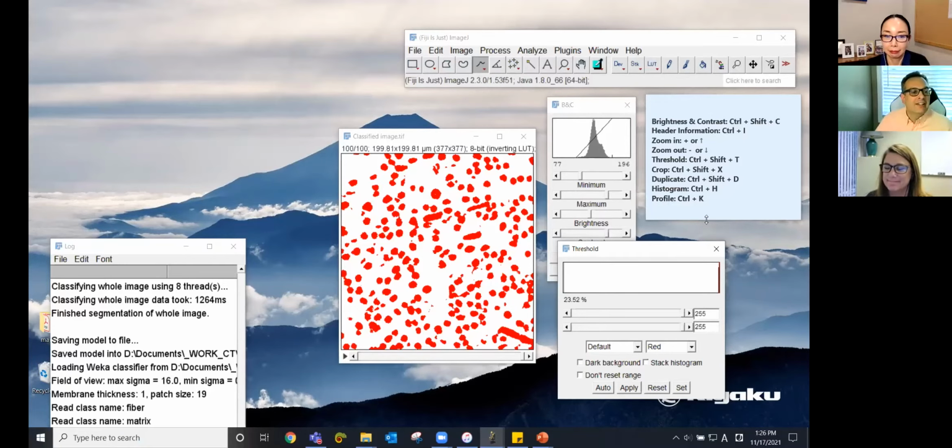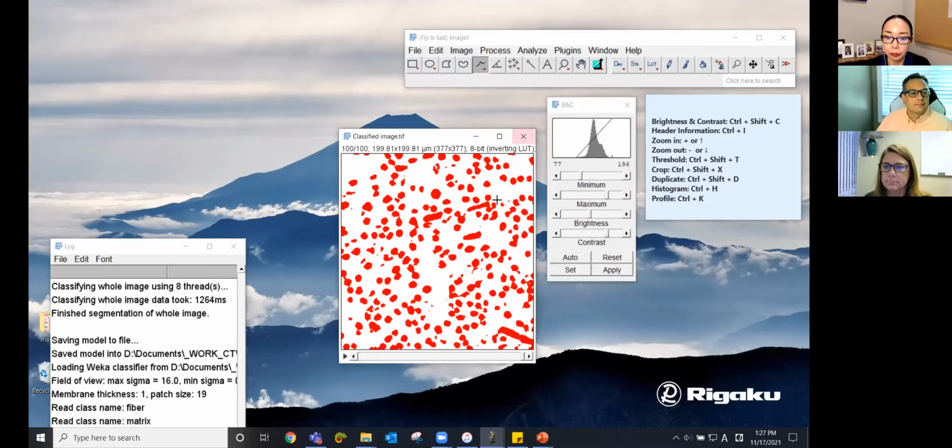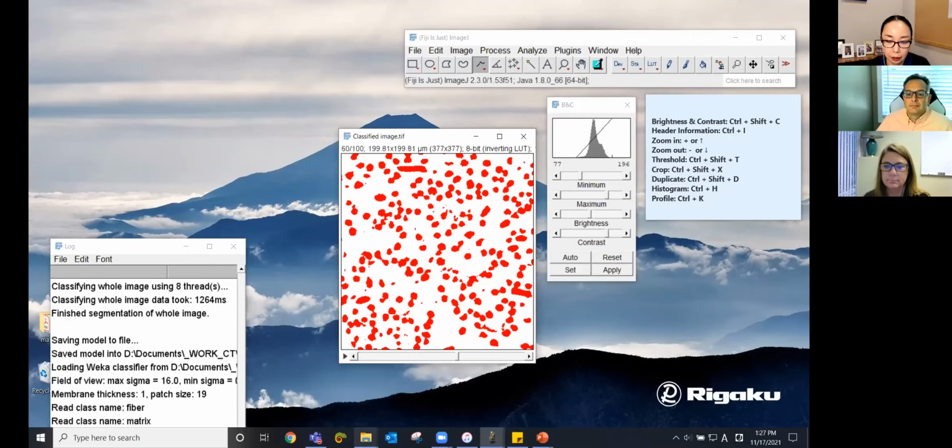All right. And then the final question at this step, and then we can go on to the next part of the session, is can you view these voids in 3D? You mean look at them in 3D? Yes. Let me close this. So we have, I selected the fibers, right? So let me do this.